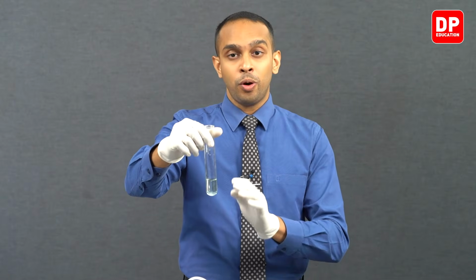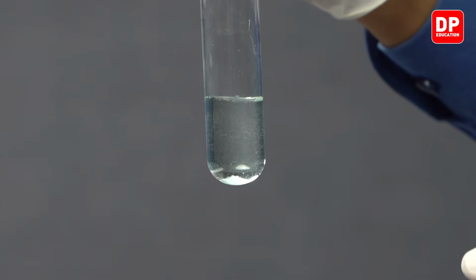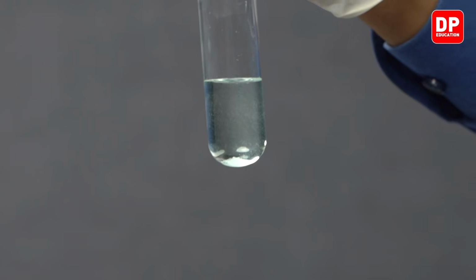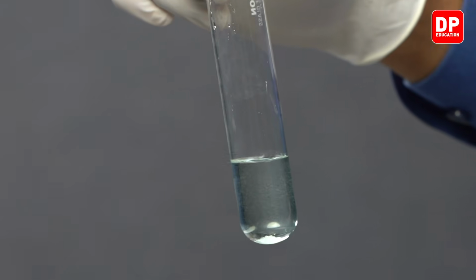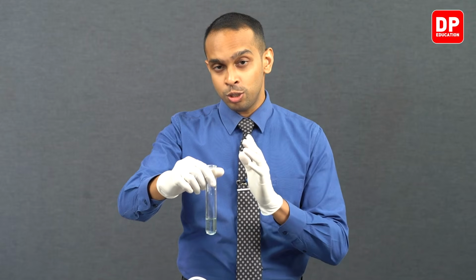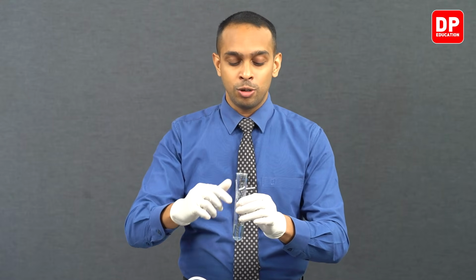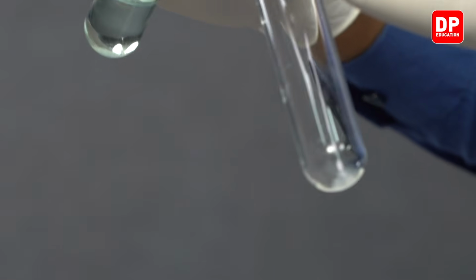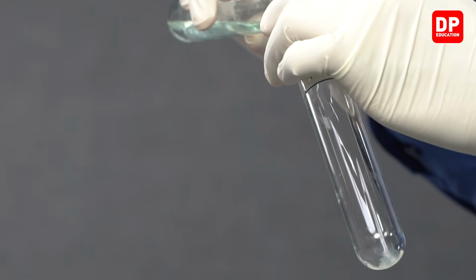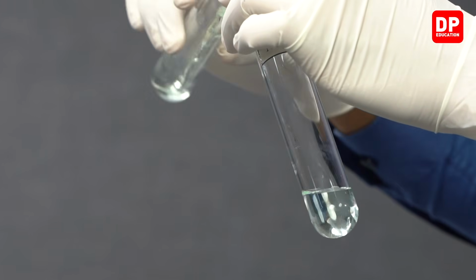So students, the importance of making Fe2+ ion solutions freshly over here is that Fe2+ ions will undergo oxidation if you leave it out for a while and turn into Fe3+ ions. So whenever you are conducting this experiment, you have to make sure that you freshly prepare your Fe2+ ion solution. So this is still a saturated solution. There's a small amount of solid still undissolved here. We are going to take a small portion of this solution into a boiling tube that we will be using to conduct this experiment.